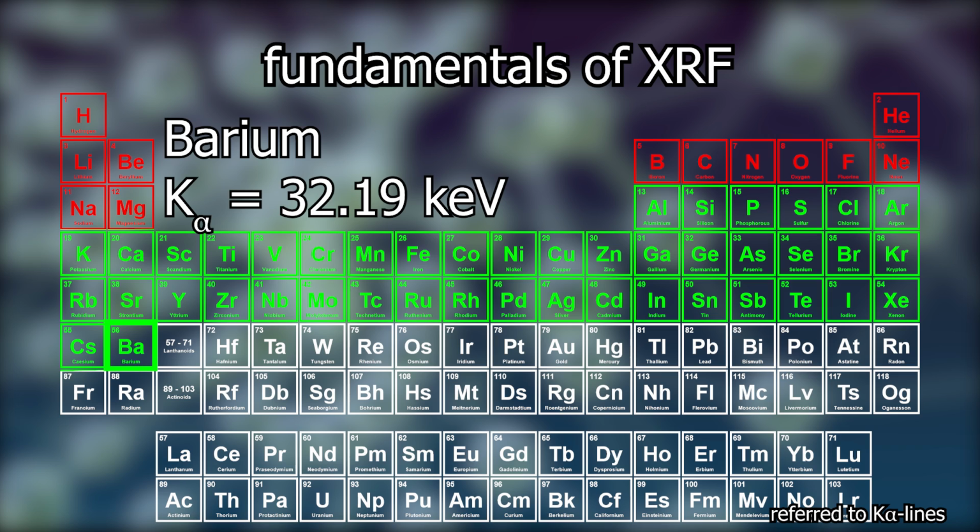There is also a new nomenclature for this. Alpha only describes the shell directly above it, and above the K shell is the L shell. So according to the newer IUPAC nomenclature, it is called the KL line. But since almost all literature still uses the old nomenclature, I will stick with this for this video as well. The L-alpha lines are lower in energy than the K-alpha lines.